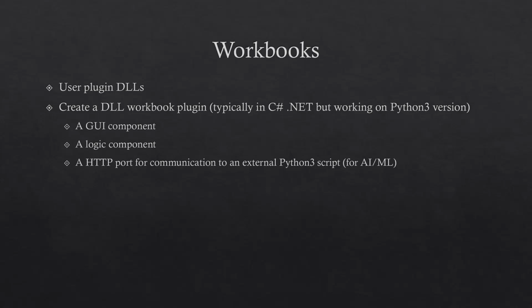the UnicornOne environment. This allows developers to create complete AI and machine learning applications containing elements such as live RHEED videos, Microsoft charts, real-time status messages, control widgets, and dedicated results panels. Just like the REST API, developers are extending the UnicornOne platform rather than modifying or rebuilding the core control system.